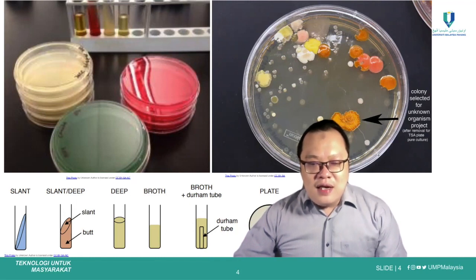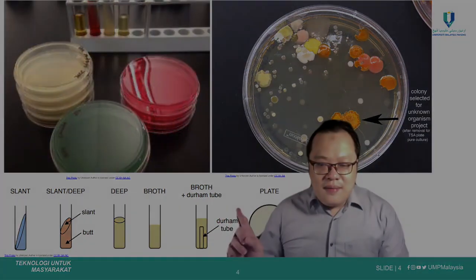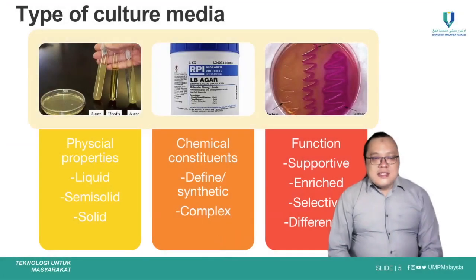Those are solidified agar, and we have liquid media of broth and also broth with the addition of a Durham tube, and also agar plate.